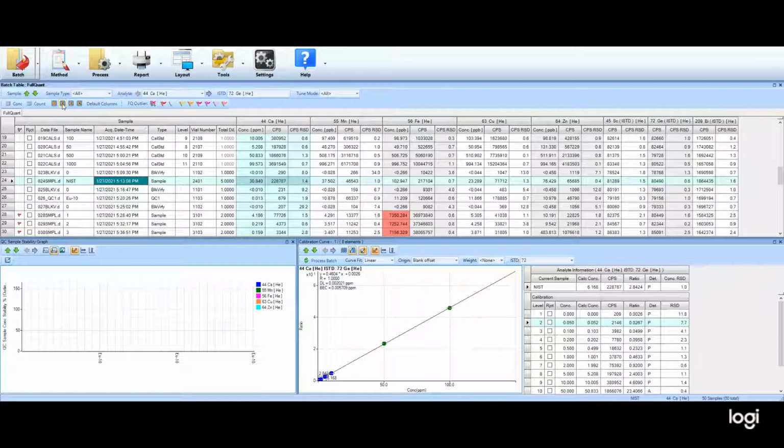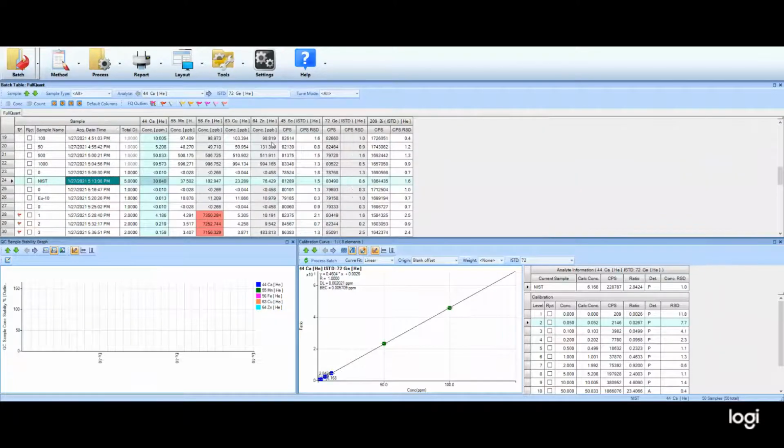I have other column settings set up that we also either use or export. In this case, it's another view of the data that we export. We export this as raw simple. Here we have a simpler display that is then more easily manipulated in our final Excel sheet to yield the results table.